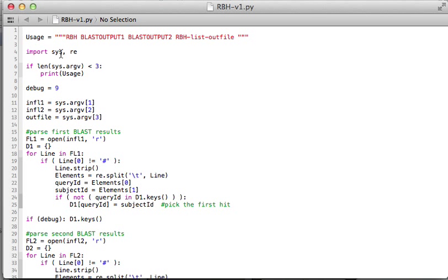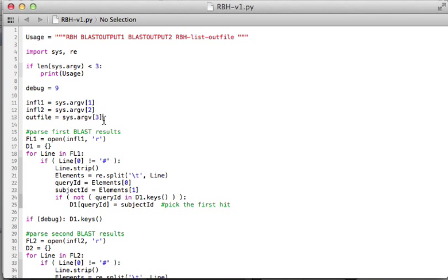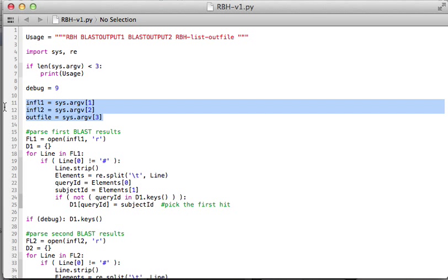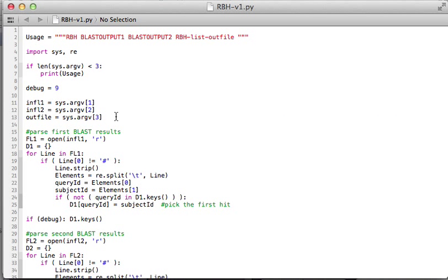I'm going to use the RE module for this demo. The input file, first parameter is the BLAST output file one, then second parameter file two, and third parameter is the output file. That's my output parameter set.